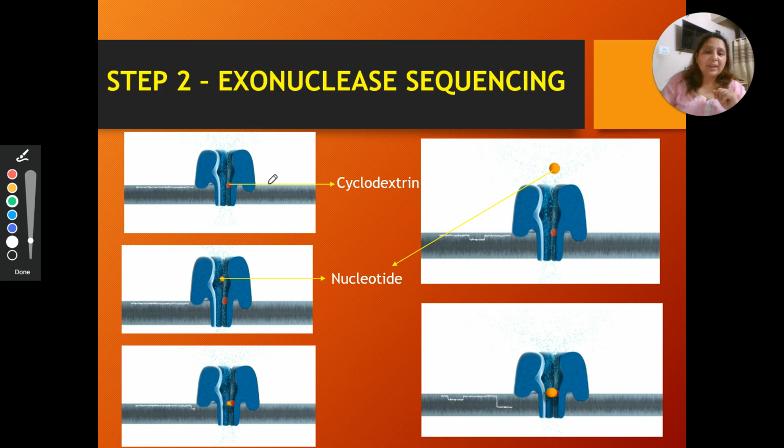That means its ability to produce a detectable signal will be less, right? अगर हम सिग्नल ही डिटेक्ट नहीं कर पाए, it is of no use. या हम सिग्नल डिटेक्ट कर सकते हैं but we do not have enough time, कि वो उतना रुक ही नहीं रहा, जल्दी से भाग रहा है कि we are not able to capture the signal. सिग्नल तो बन रहा है लेकिन we are not able to capture.